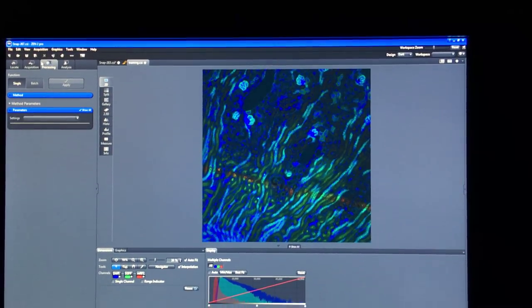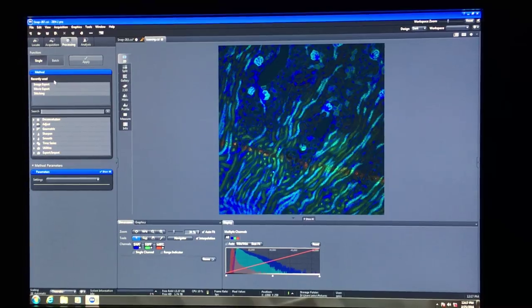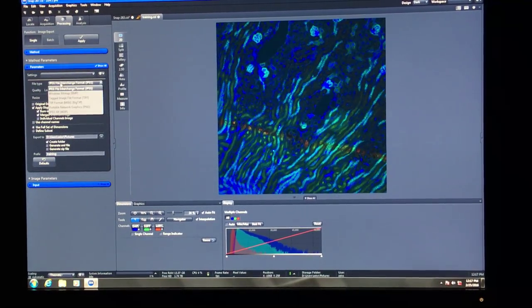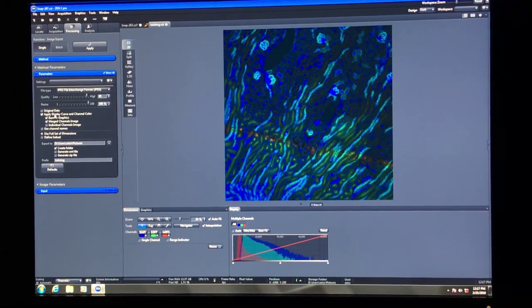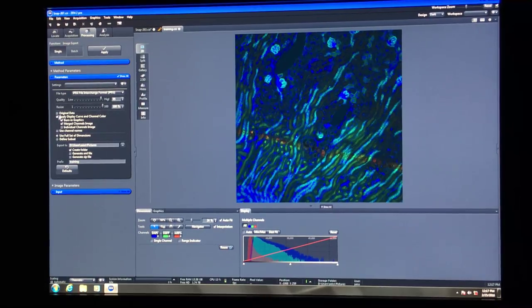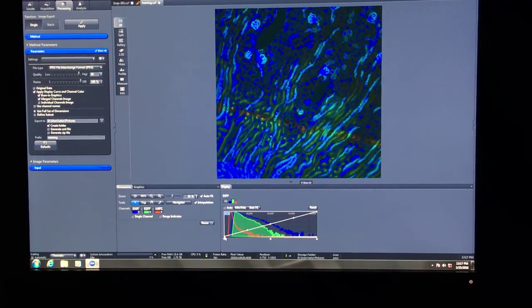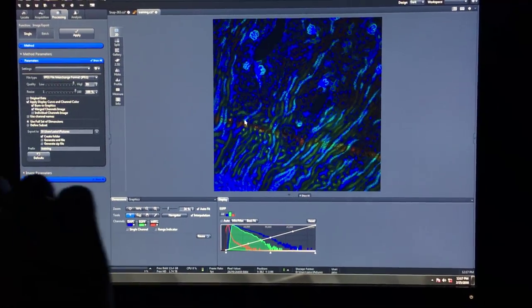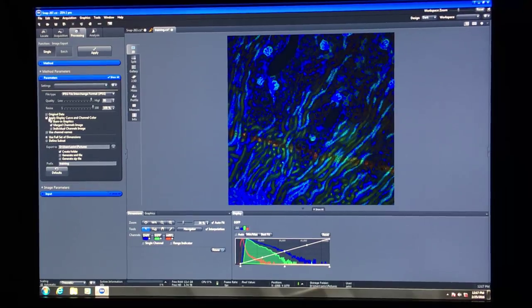Now you can go to the Processing tab and use different methods. Say your software can only open JPEGs or TIFFs, or a publication requires a TIFF. You can do an image export. Make sure the 'Show All' button is checked so you have access to more settings. If you made any modifications to how the image looks and want those exported in the JPEG as well, make sure you check 'apply display curve and channel color.'